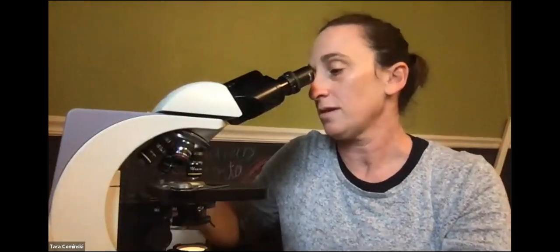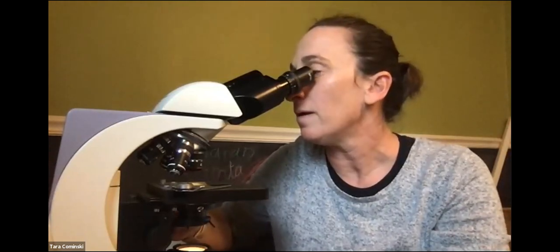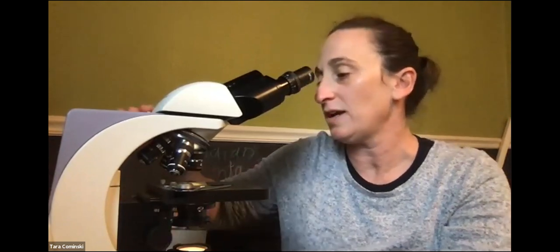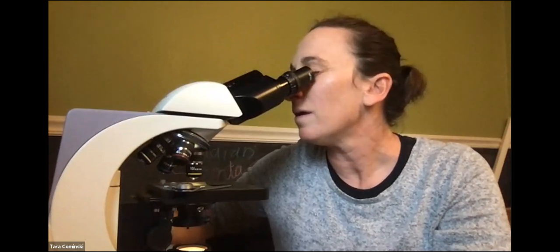All right, so let's just see what we got here. Again, I got to go to scanning, right, and get it on. Oh, it's actually not too bad. Let's see what we can get here. I got some droplets kind of on there, a lot of air bubbles, but let's find a spot where we don't have as many. All right, let me see if I can get it if I use low power. Yeah, all right, so I'm gonna show you guys. It actually worked out kind of well.